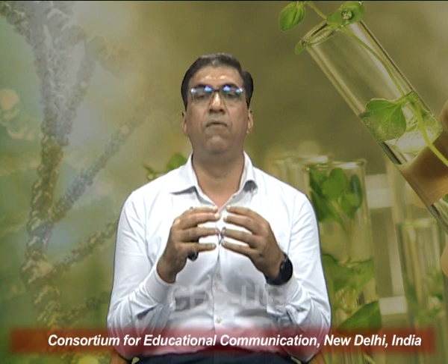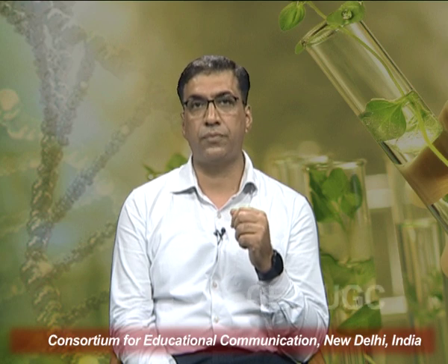Such hindrances on the optical surface of the detector will give you a false reading about the turbidity of the culture media, and therefore it becomes highly unreliable to maintain those cultures on the basis of turbidity, and therefore regular maintenance of those detectors is always required.